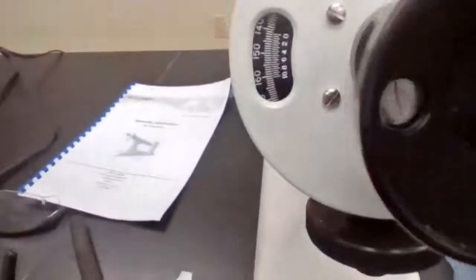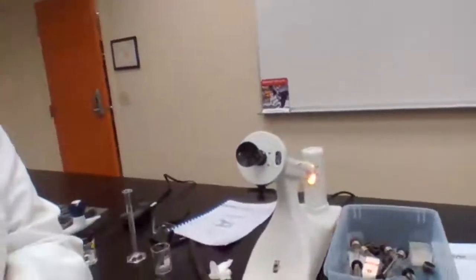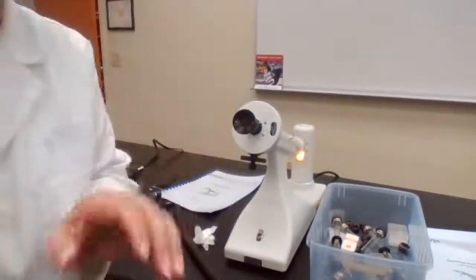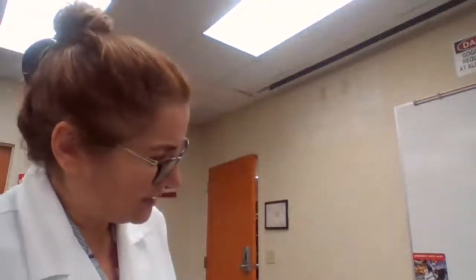It's very hard for you to see it, but you probably have to trust me based on the number. Can you see anything? Do you see any of the numbers? No? Okay. It's not easy, because the eyepiece is about 1 millimeter in diameter. I wouldn't be surprised if you don't see it.